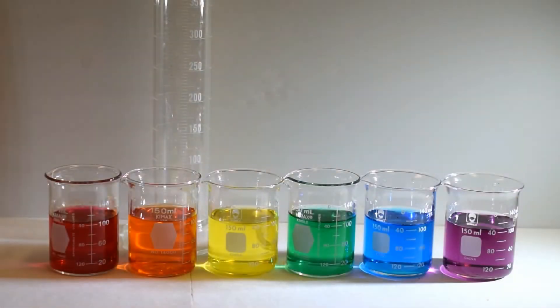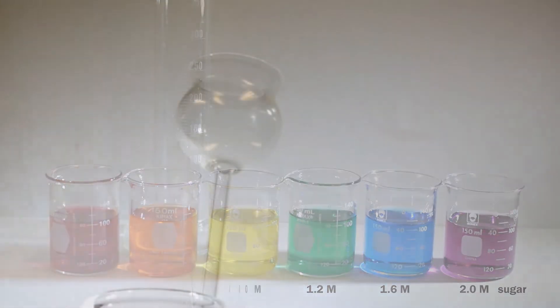Next, the six solutions of various densities are lined up beside the cylinder and will be poured into the funnel reservoir one after the other, starting with the least dense red solution and ending with the most dense purple solution. So, let's begin.